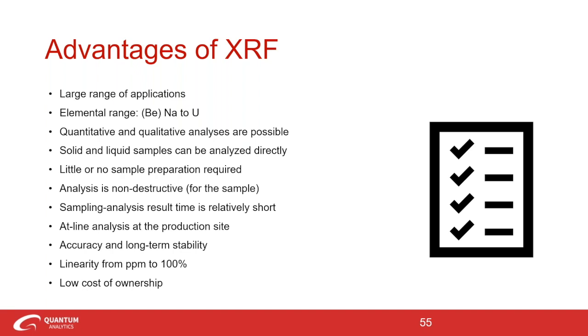A knowledgeable person is required for building an empirical calibration, right? This is that calibration curve that you establish. But once that's done, the day-to-day use is simple, and any operator doesn't have to be all that experienced to run an XRF system. So the operator can select the sample, select the position and the application, enter the sample ID, press the button, and get the results. Again, it makes it very simple.